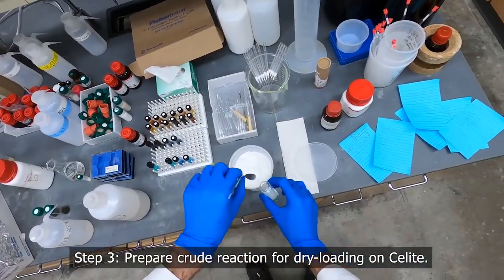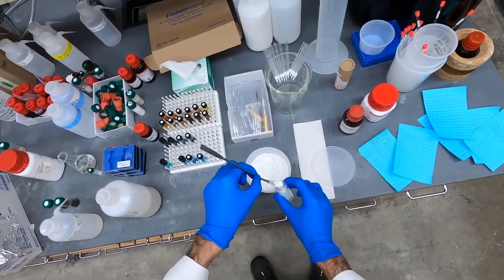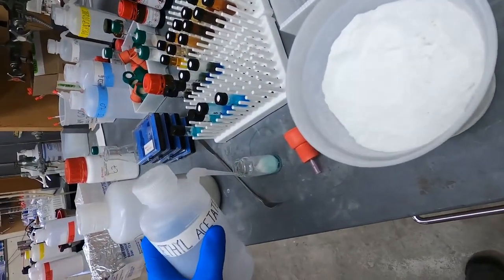And I use Celite, and I do tons of Celite here, it doesn't matter. Looks fine. Rinse that down.